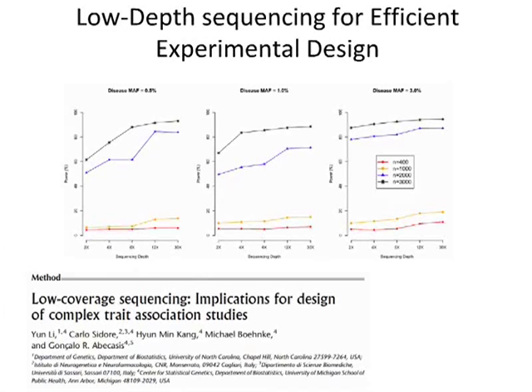Stated another way, if you have a set sequencing budget and a large number of available samples, you can gain significant power in a study by doing more samples at lower depth rather than fewer samples at higher depth for the same sequencing output. And that's essentially what this paper explains in very nice detail.